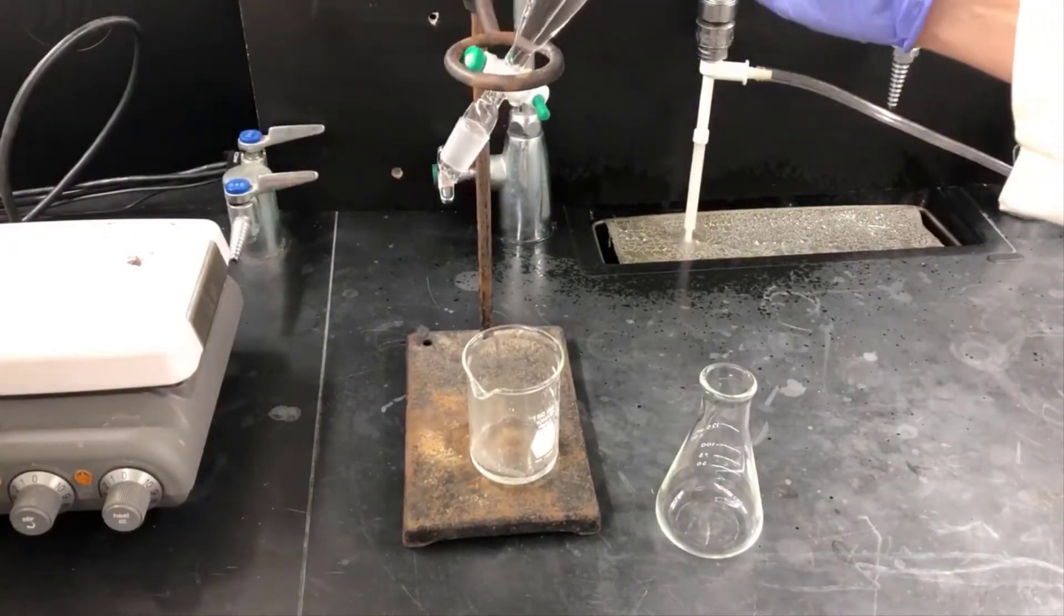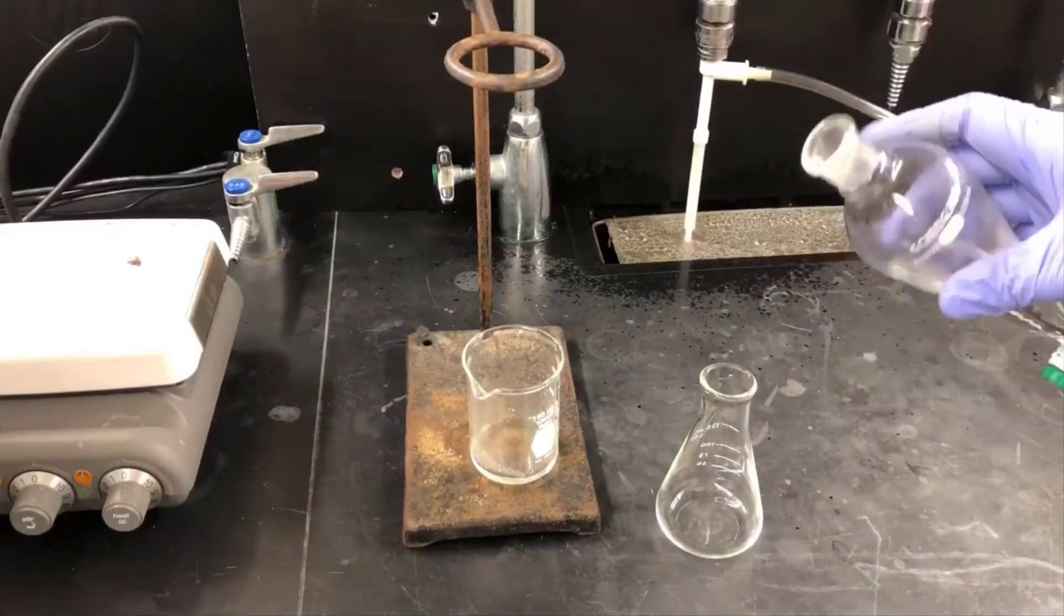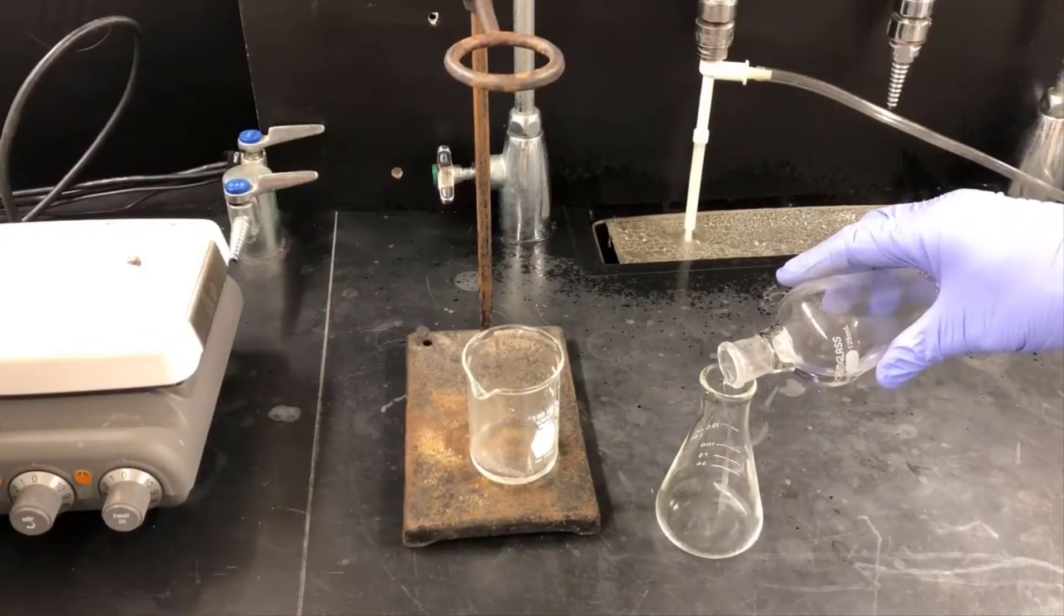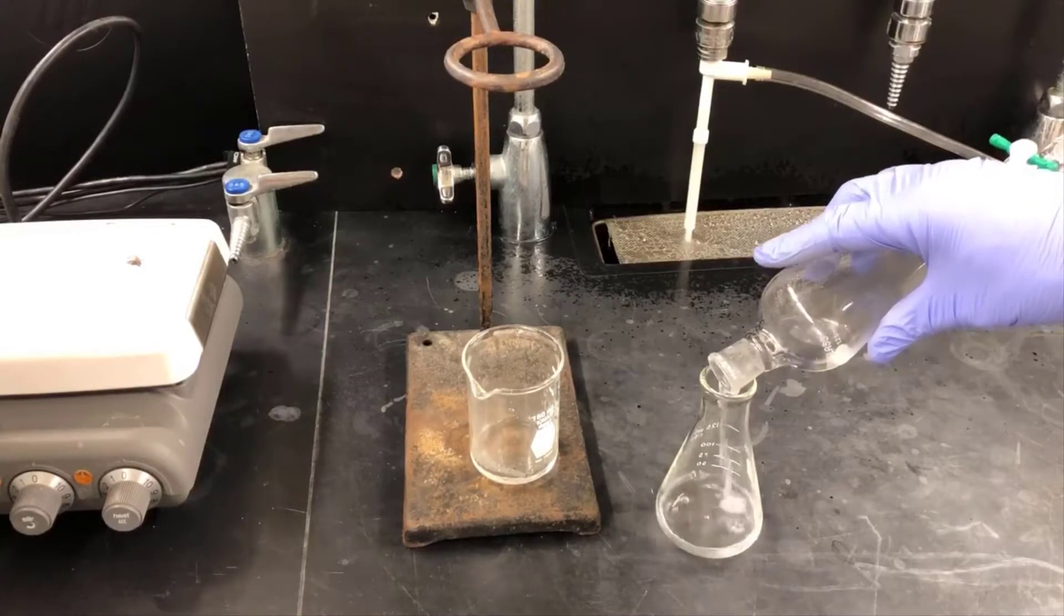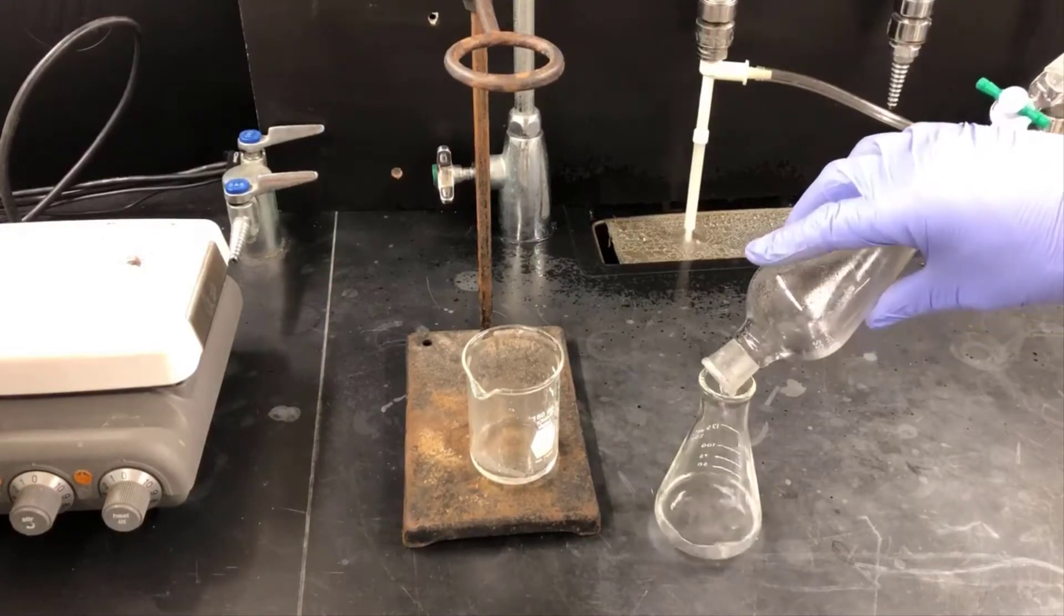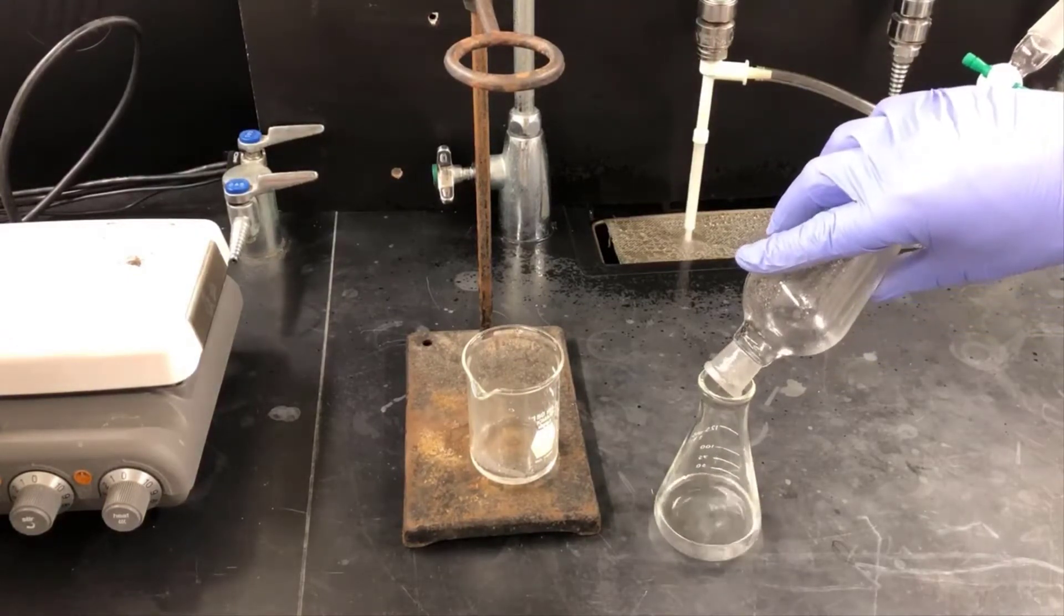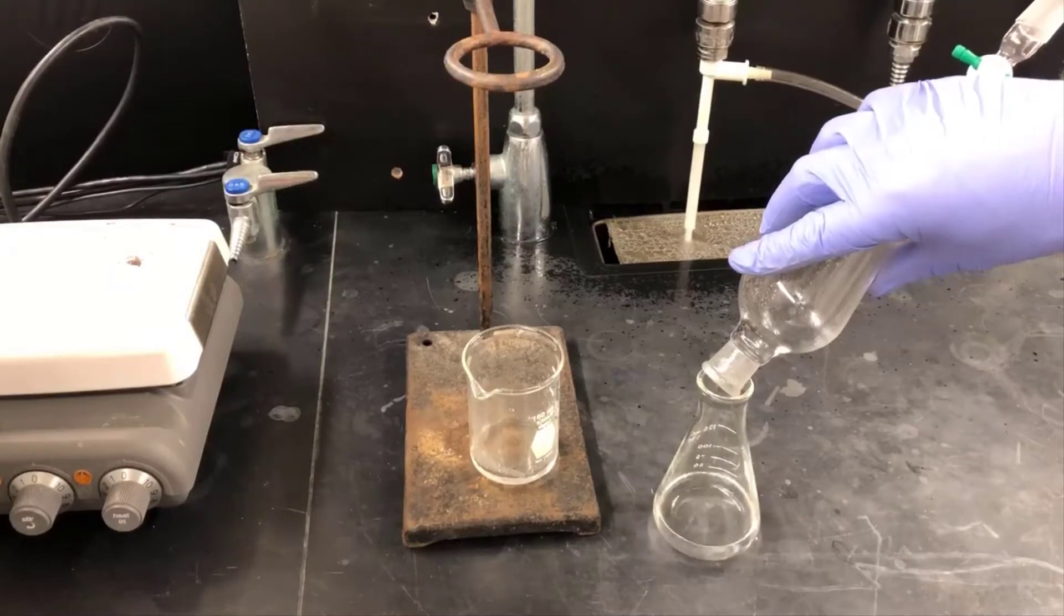Now I'm pouring the organic layer out the top of the separatory funnel into a clean-dry Erlenmeyer flask. It's better to pour the top layer out the top than to drain it out the bottom because the stopcock contains a little bit of water layer. You'll get a little bit of the aqueous layer, the brine layer, in your solution if you drain it out the bottom.